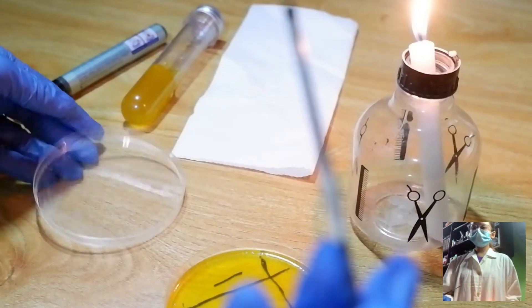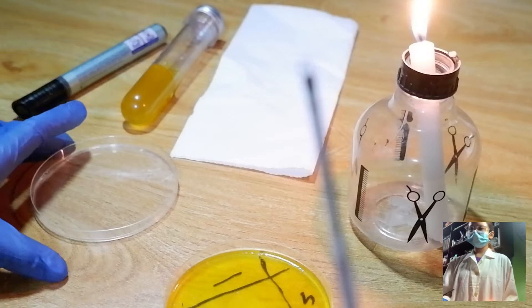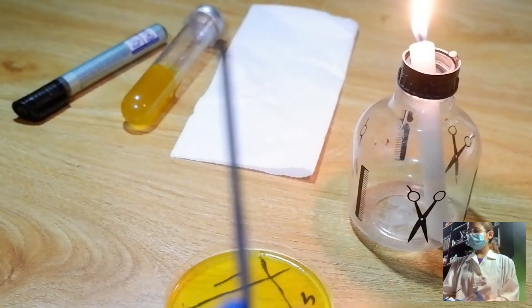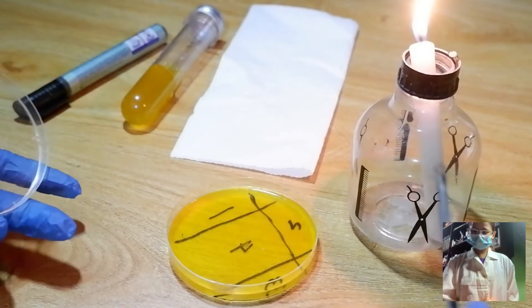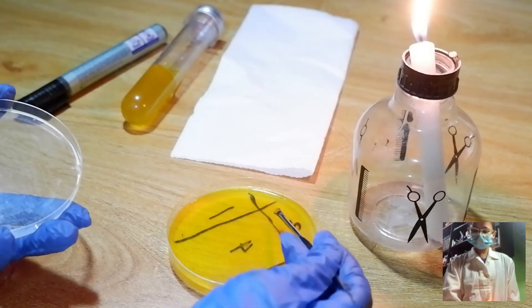Now, I will spread the organisms by streaking 5 to 6 streaks from area 1 to 2. This is our area 1 to 2.